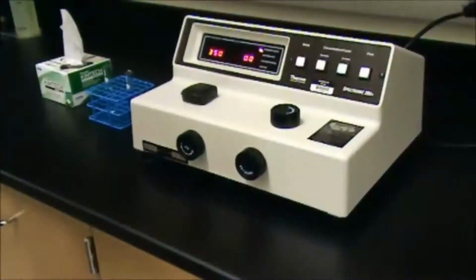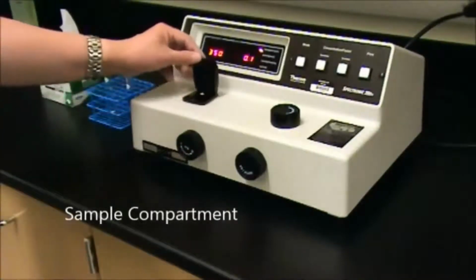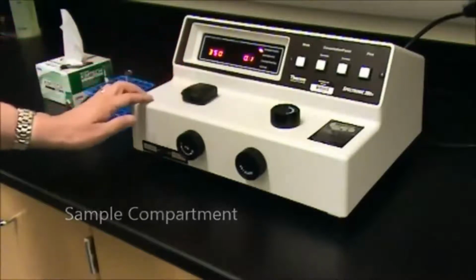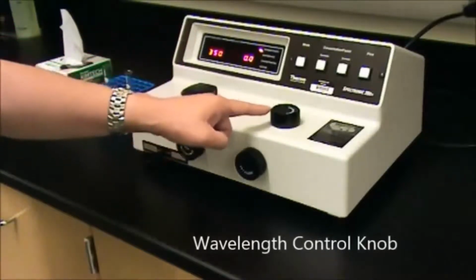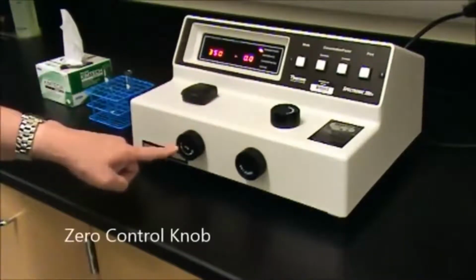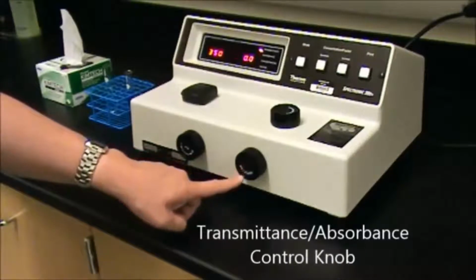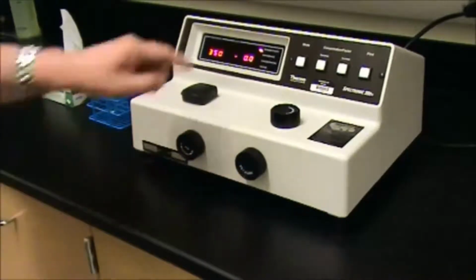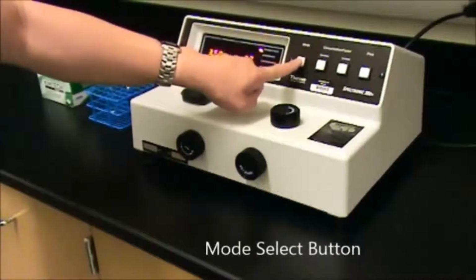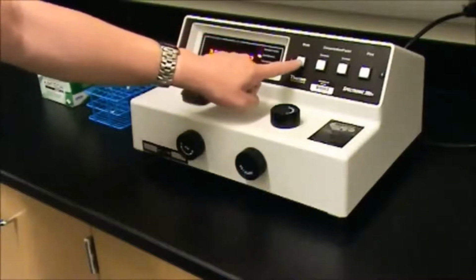Let's go over the parts of the spectrophotometer. First, you have the sample compartment. The lid opens and closes to put your sample inside. You have the wavelength control knob to change the wavelength. This is called the zero control on the left-hand side. And this is the transmittance absorbance control on the right-hand side. Right on top is the mode select button. And when you push the mode select button, you'll notice that the LED will change positions. And so will the readout.